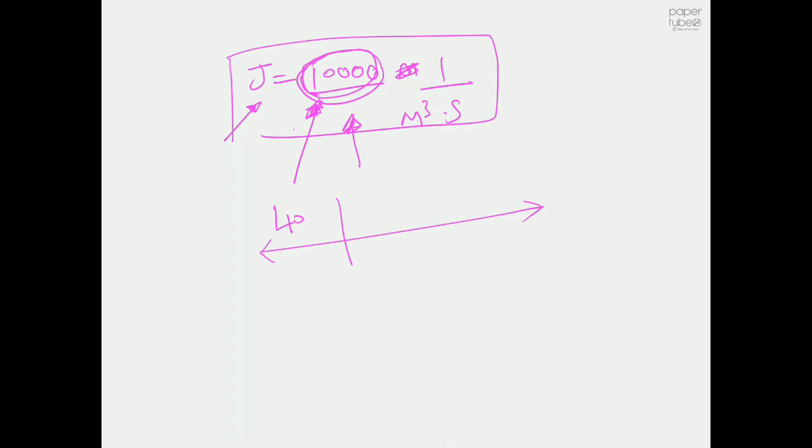But normally in the lab we do up to 400. Some people do up to 300 vials. It depends on the level of sophistication we have in the lab and the time we have. So I think so far so good.